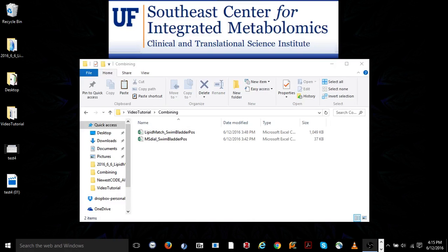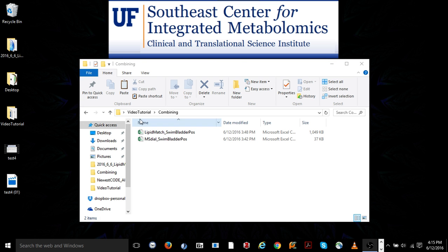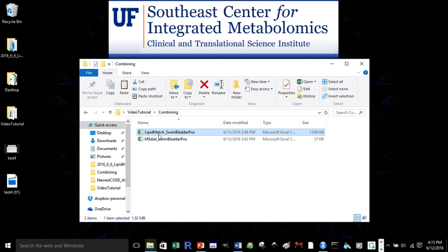Hi, this is Jeremy Komel, and welcome to Tutorial 5 for LipidMatch. In Tutorial 5, we're going to show how we can combine output identifications and feature lists from LipidMatch with other identification software, such as MSDial.